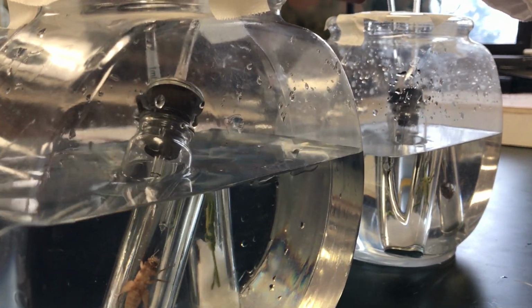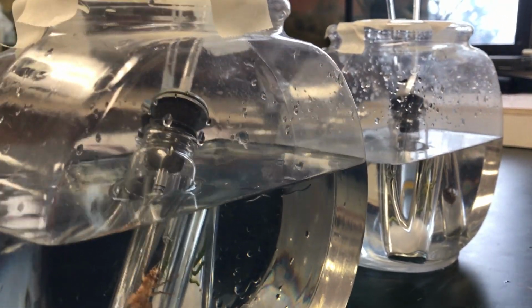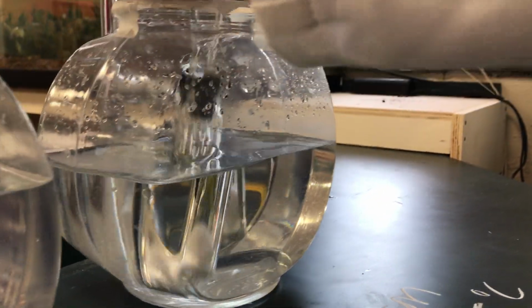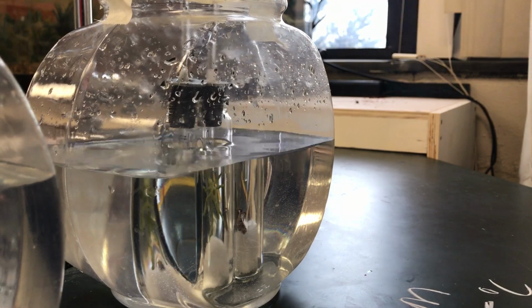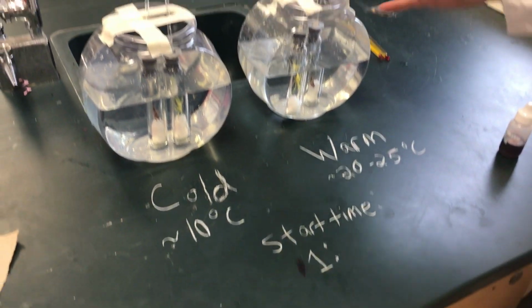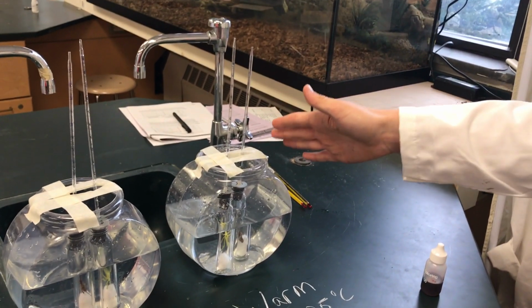Preferably do this before you add tape to the top. Absorbent cotton. Yes. Add as much weight until they sit perfectly down. The tape will help keep the tubes from moving side to side.